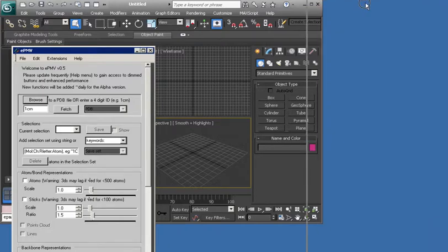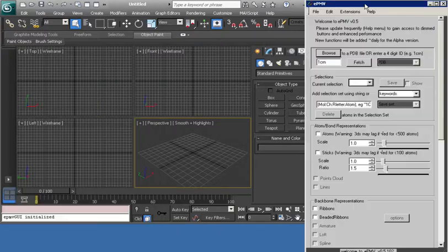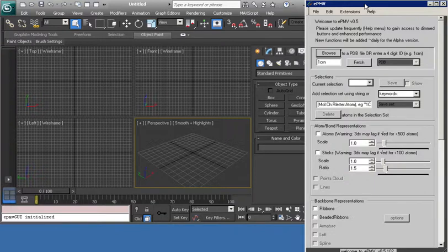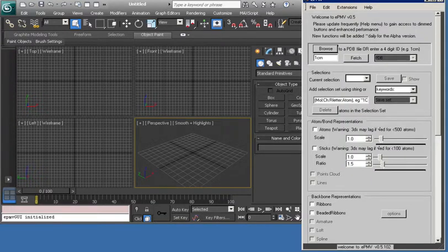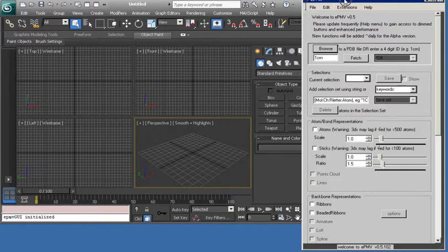So if you can install EPMV, get it running, I've got version 0.5.102. It's got a little bug in it which I'll show you how to overcome.